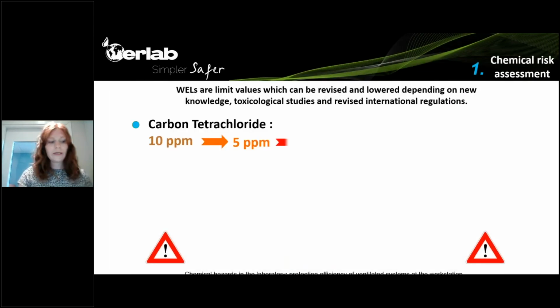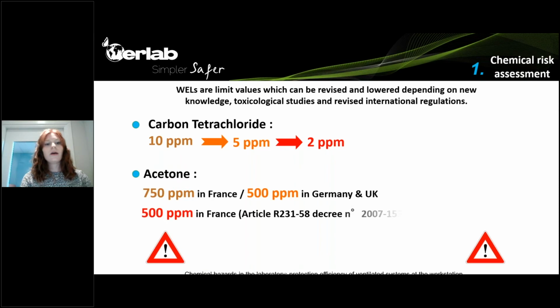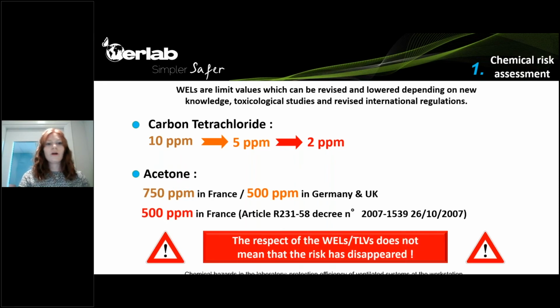The WELs can be revised and changed over time, depending on new knowledge, new studies, and new international regulations. If we take carbon tetrachloride, in the past the WEL was 10 ppm, and now it has been changed to 2 ppm, due to the fact that new studies have been made.